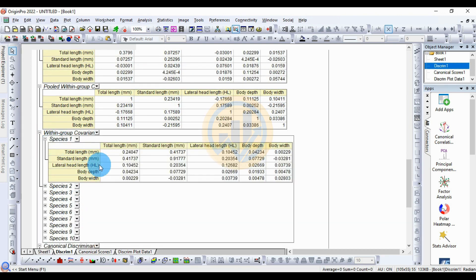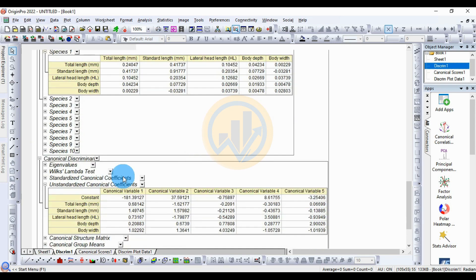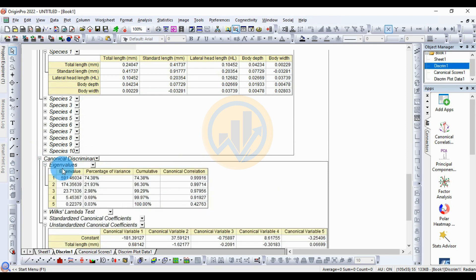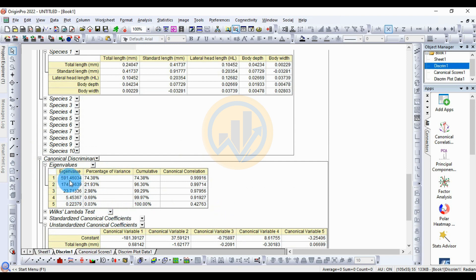Click the plus symbol to expand the within-group table for the 10 species. Next, the canonical discriminant analysis section — the eigenvalue table for the five canonical variables. The first eigenvalue is 591.46, percentage of variance is 74.38% — the highest percentage — and cumulative value is 74.38%.